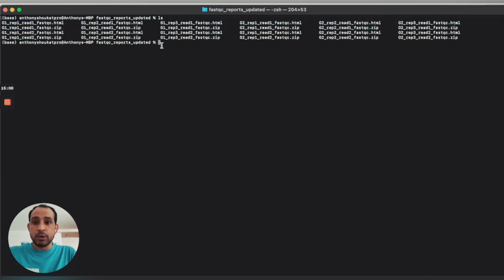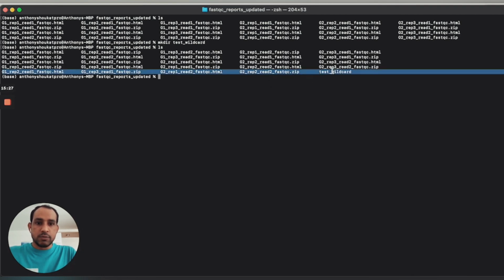Here I'm going to make a new directory called test wildcard. So now we have a directory test wildcard. We want to move our HTML files to the test wildcard directory. As you can see, our wildcard directory is here.